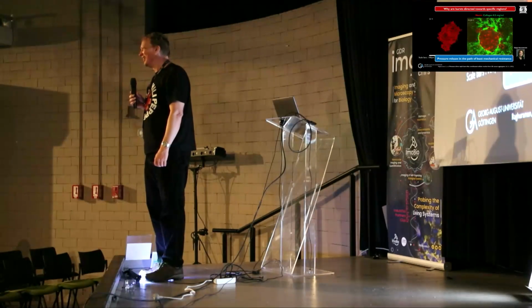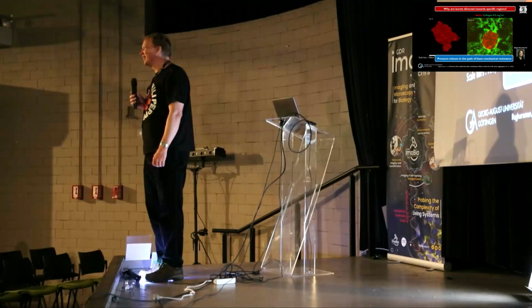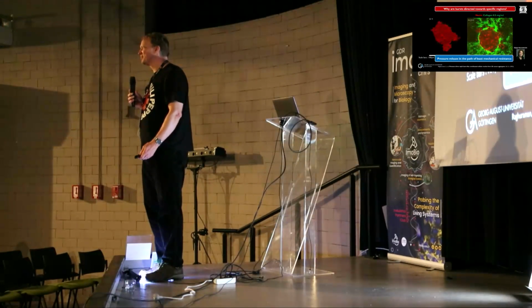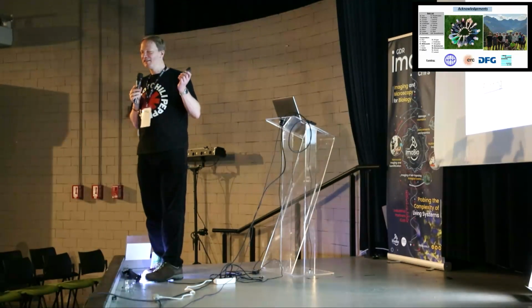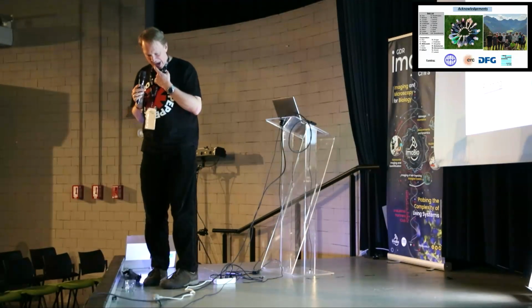Thanks for the nice talk. Maybe that's already what you did, and I didn't get it. But on the developing zebrafish embryo, it looks like the shape of the yolk sac can have some information. When you have the wave of cells propagating, it seems like it bulges out. Could you apply this Navier-Cauchy approach to the yolk sac and get some information?